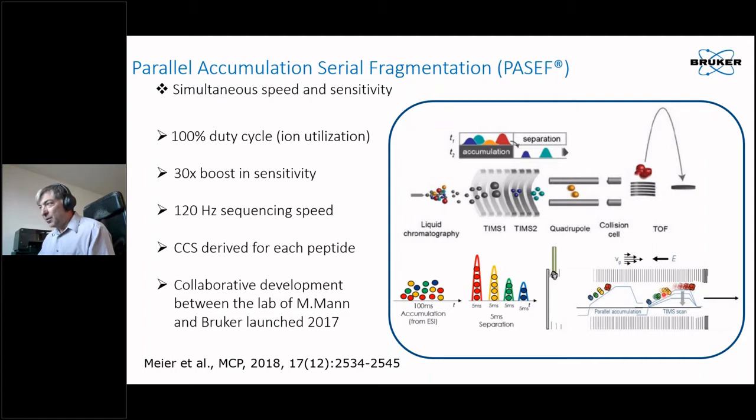The ions that are bigger feel more push from the gas and get pushed further up the potential hill. So this device is a way to separate things according to their collision cross-section or their ion mobility. The lowest ion mobility, largest ions end up near the exit, and the smallest ones end up at the beginning.